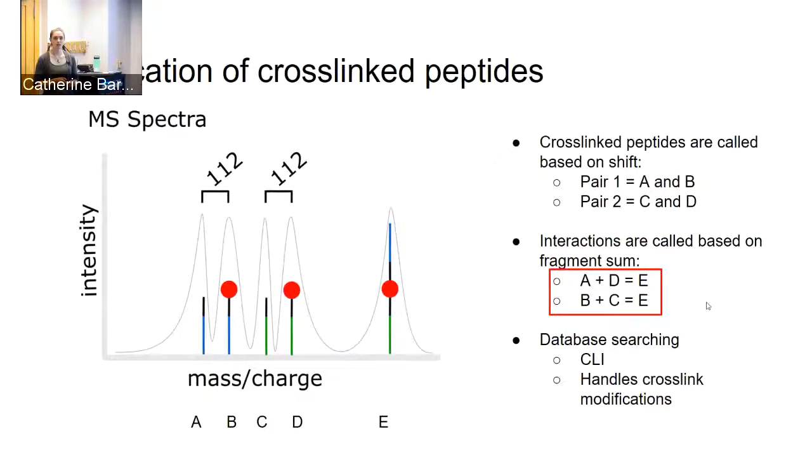When you do database searching, there's certain assumptions. For example, you use trypsin cleavage. That means the next residue must be some amino acid. I wonder whether the cross-linked amino acids also have some requirement.